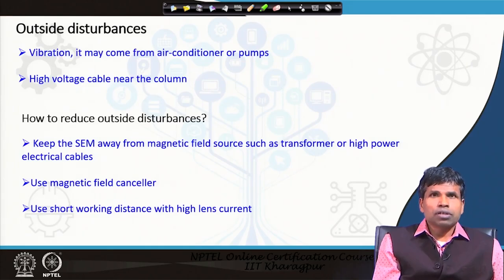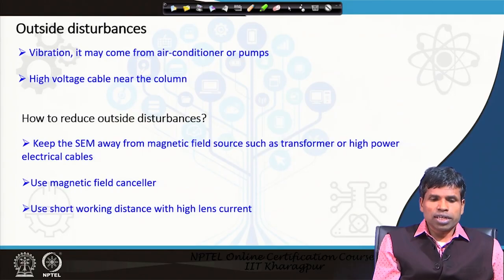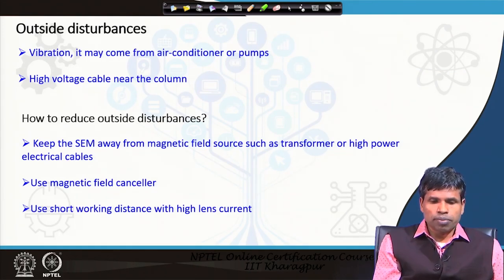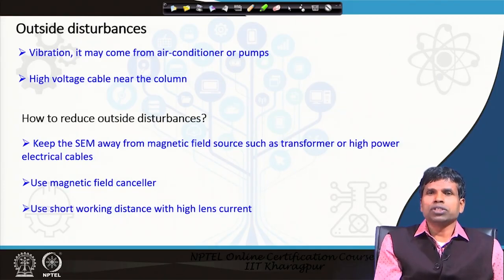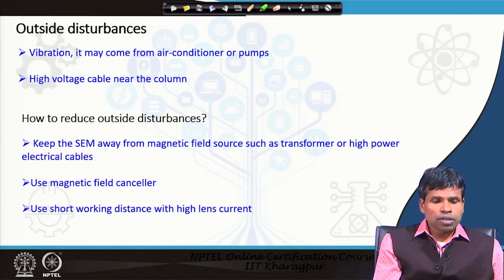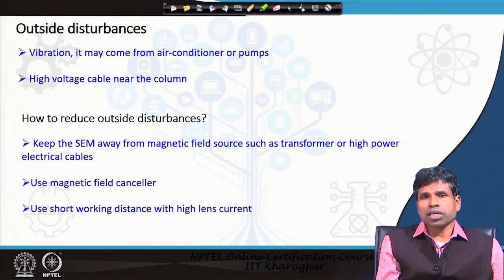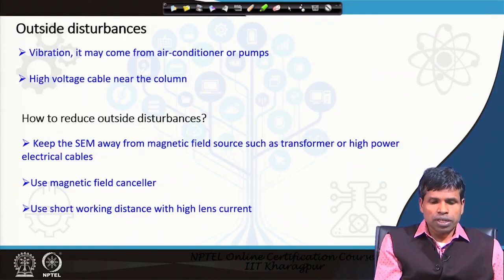External disturbances such as vibration may come from air conditioners, pumps in the microscopy room, or high-voltage cables near the column. We do not allow high-voltage electrical cables near the room. To reduce outside disturbances, keep the microscope away from magnetic field sources such as transformers and high-power electrical cables. Use a magnetic field canceler — as used in high-resolution transmission electron microscopy studies. Using a short working distance with high lens current is another approach that is under the operator's control.